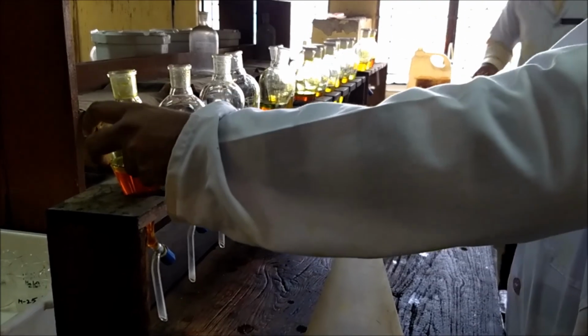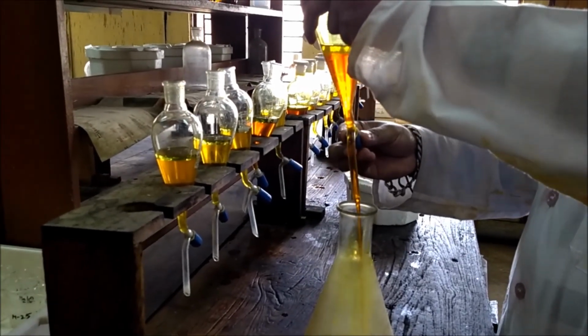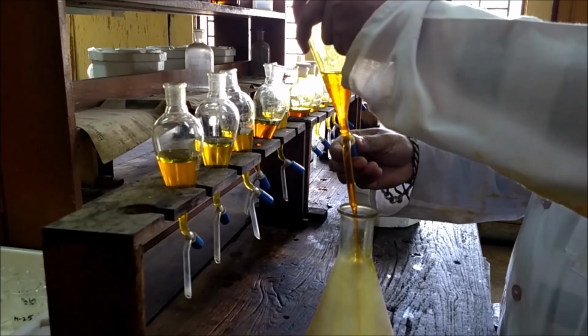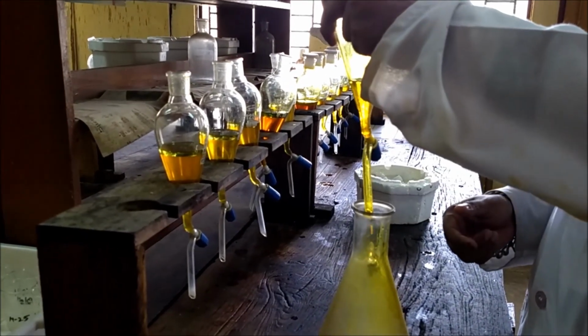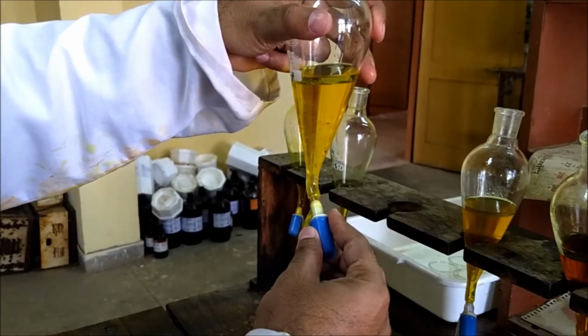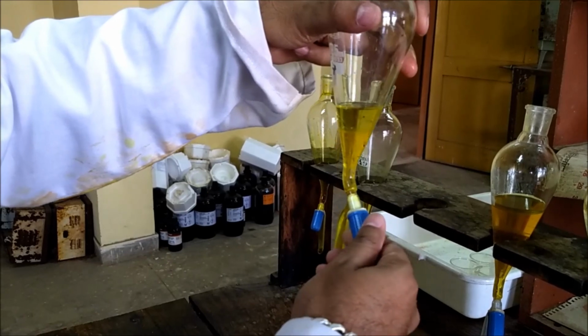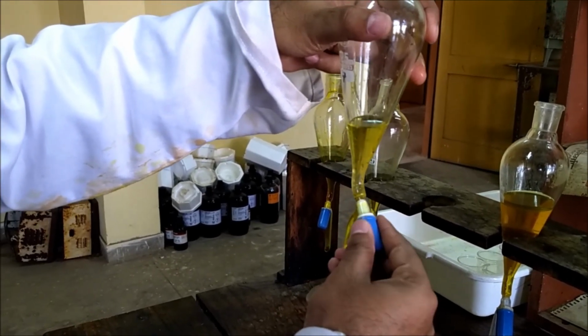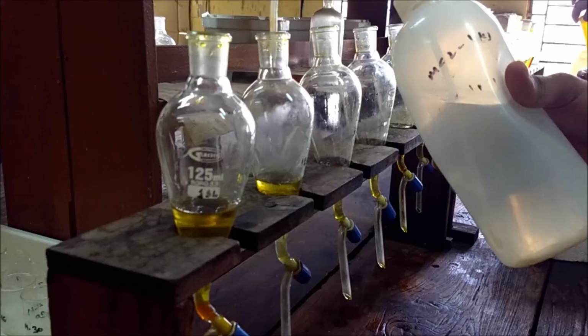Now open the lid of the funnel, and we are going to remove the aqueous phase as our target element is now in the organic phase only. During the removal of the aqueous phase, we should be very careful so that not even a few drops of organic layer go along with the aqueous layer.